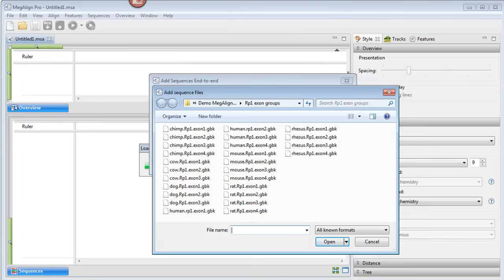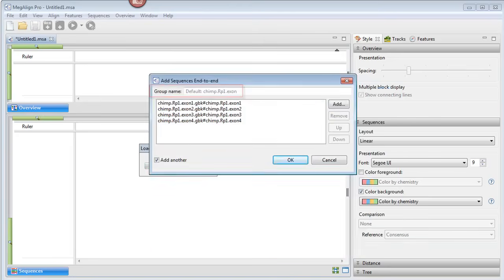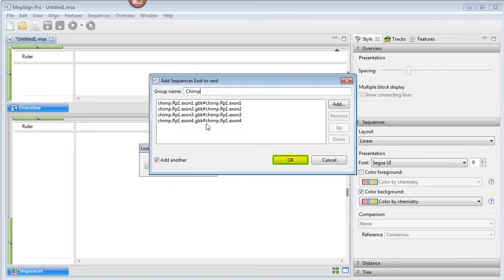We'll use Shift and Click to select the first four segments, which are Chimpanzee, and then click Open. In the Group Name text box, we'll replace the default name with Chimp, and then click OK.